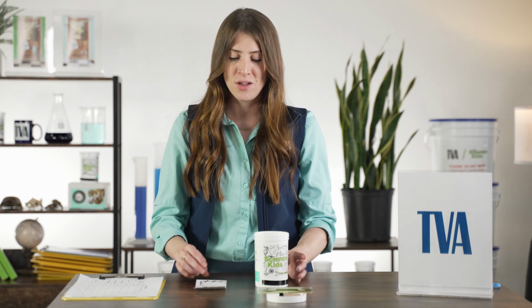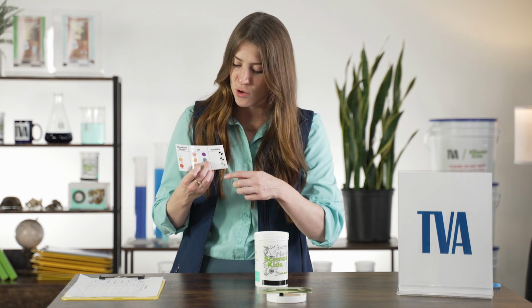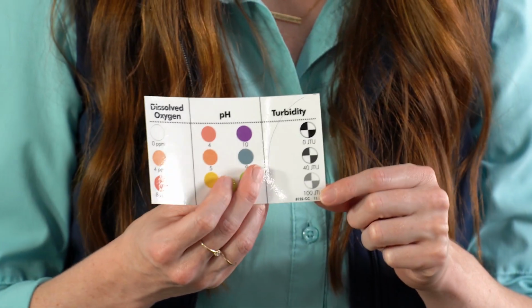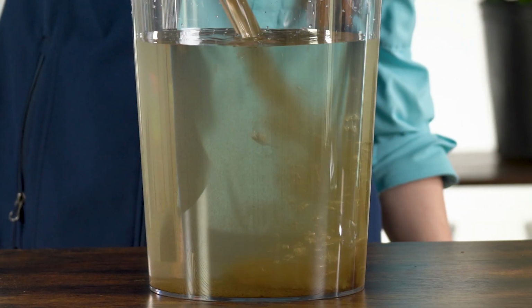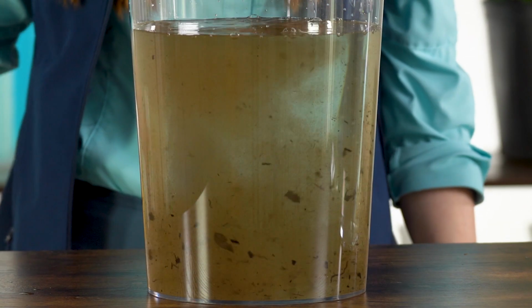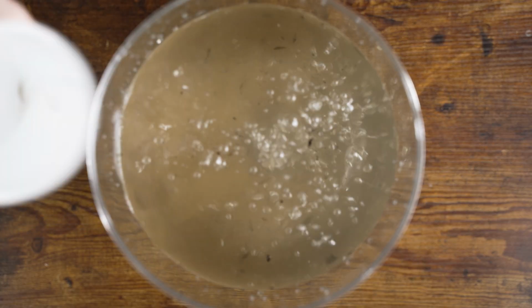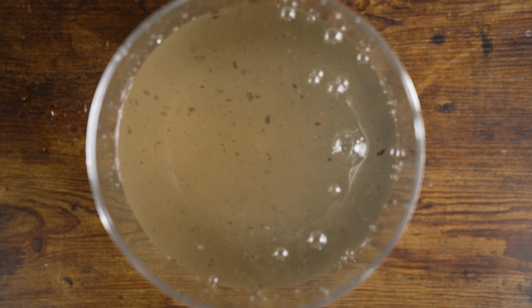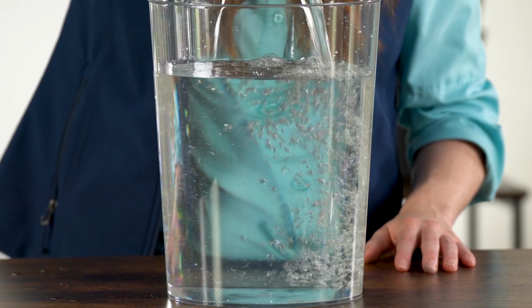For this test, we're going to use the comparison card in your kit. On your comparison card, you have this half circle line with the Secchi disc. You have 0 JTU all the way up to 100 JTU. You may have clearness or clarity to your water, but the water will still have a color or murkiness to it. So 100 JTU is so much suspended matter that it'd be difficult for aquatic life that have adapted to visual cues to survive. Or it may be hard for aquatic plants to get sunlight and photosynthesize. 0 JTU is crystal clear water as far as you can see.